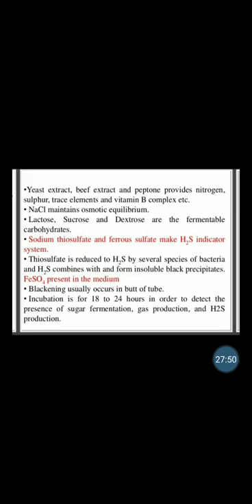Sodium thiosulfate and ferrous sulfate make the H2S indicator system, that is hydrogen sulfide. Thiosulfate is reduced to H2S by several species of bacteria, and H2S combines with FeSO4 present in the medium to form an insoluble black precipitate. This blackening usually occurs in the butt of the tube.